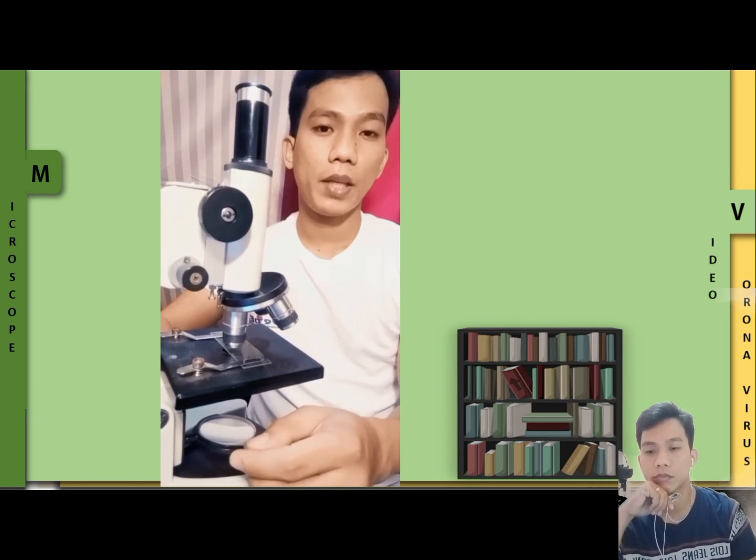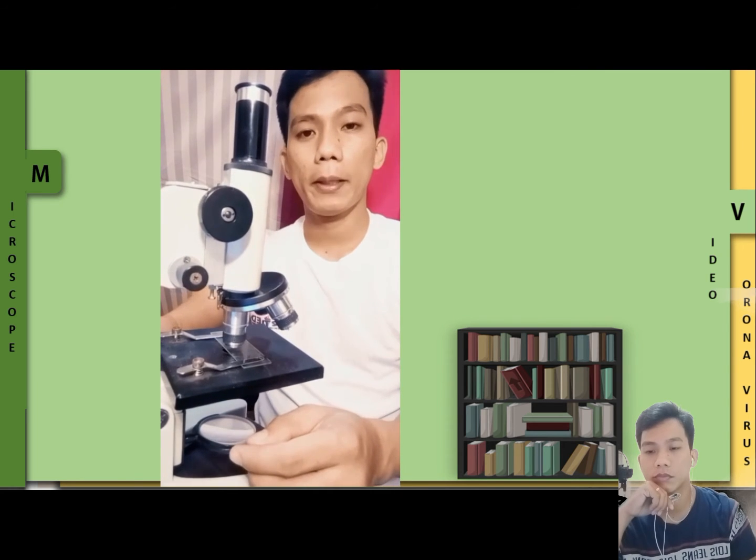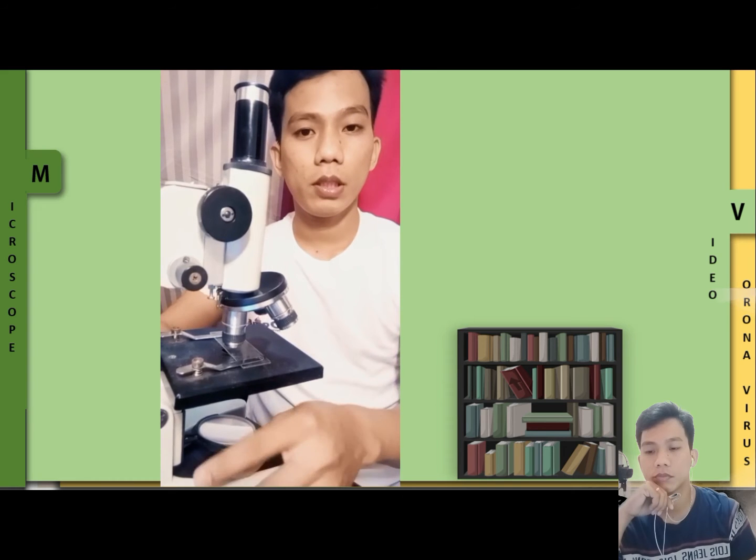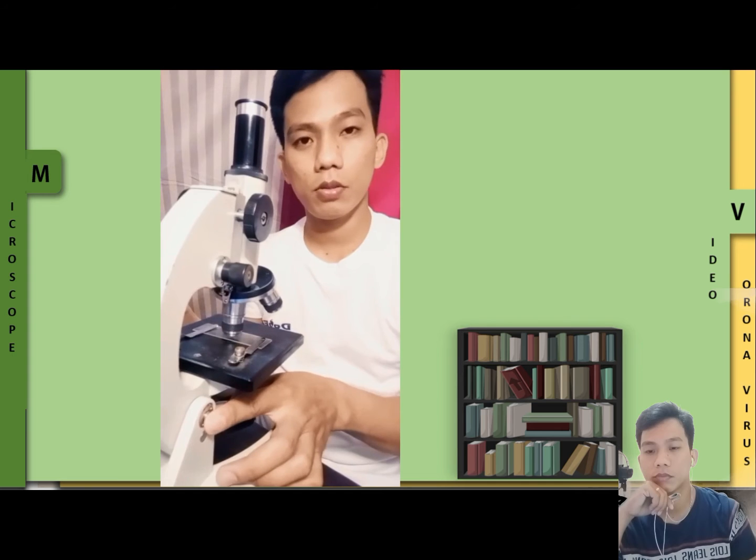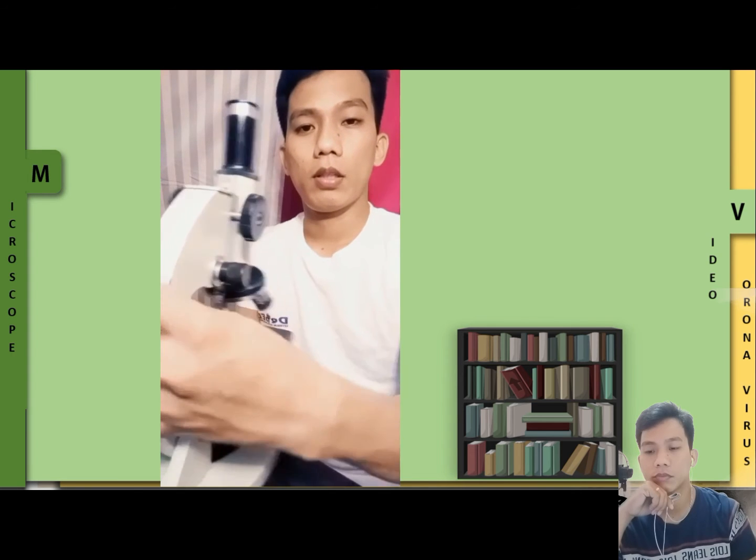Next is your inclination joint. Okay? So, ano yung inclination joint natin? This one is the inclination joint. Ano pa ang gamit ng inclination joint? So, okay, ganito siya.